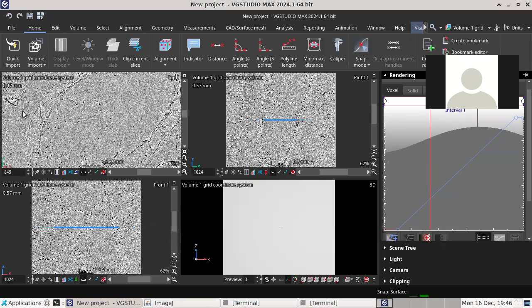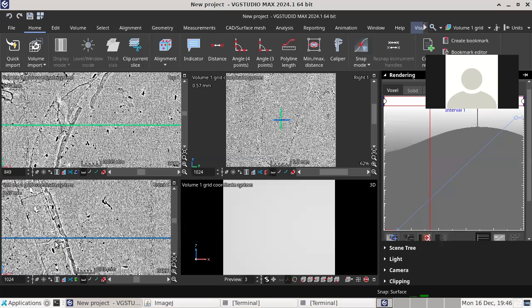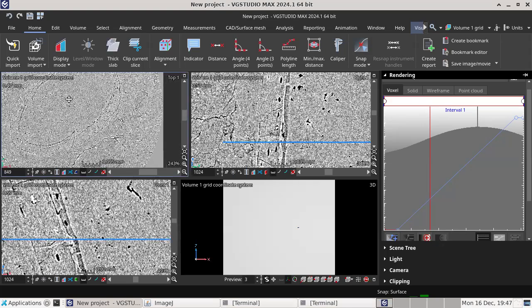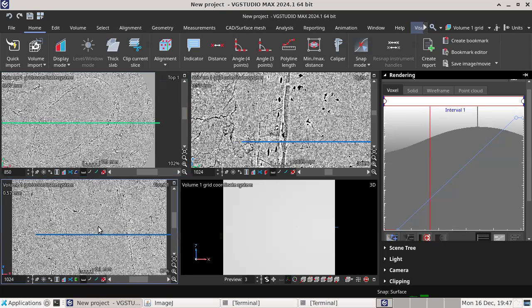So here you see the bone. It's just phase contrast. No phase retrieval here. It's very old. We were not doing that back at the time. And what we want to do is a thin section. A thin section is where you make a small section and the light goes through it and you average everything that you see in a single image. So here we want to do the same thing. We want to mimic a section and make sure that the light can go through it.